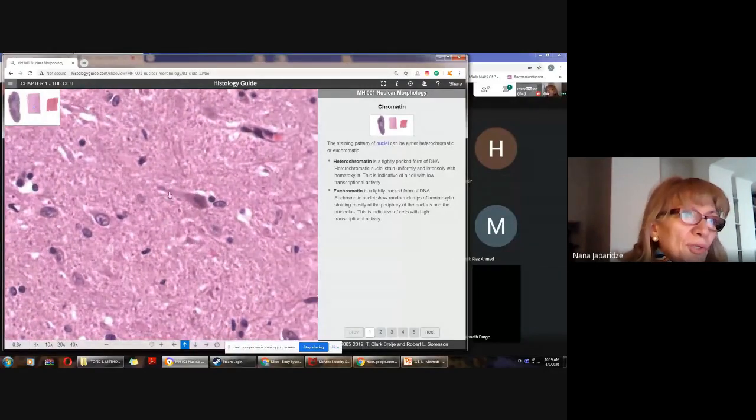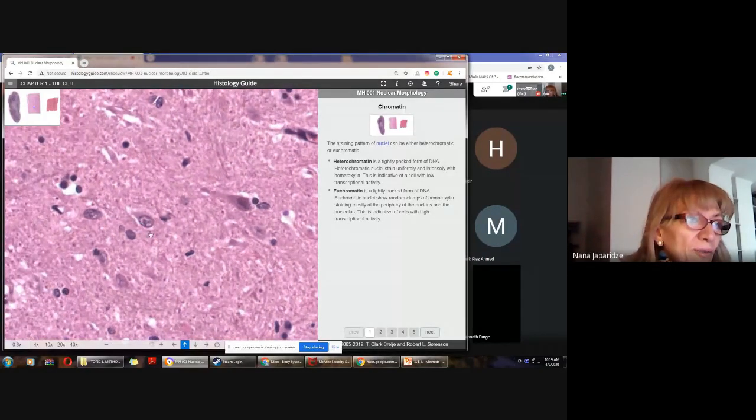Look, huge neuron, very big nerve cell. This is nucleus, and this one is cytoplasm. Here is glial cells with a quite dark stained nucleus. Another neuron. Look, another neuron with a nucleus and cytoplasm. So quite well visible nucleus is here.